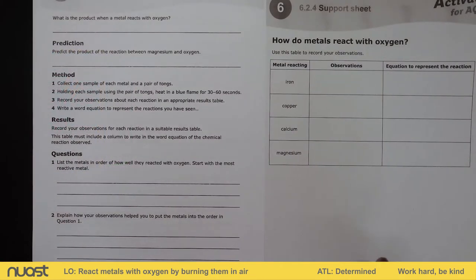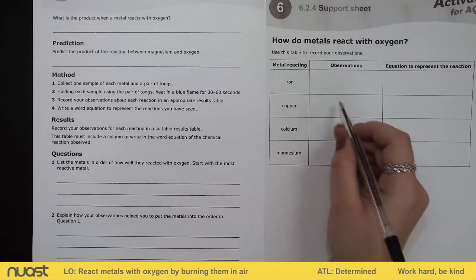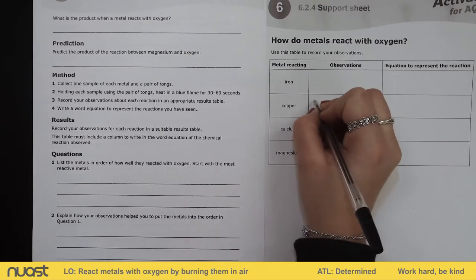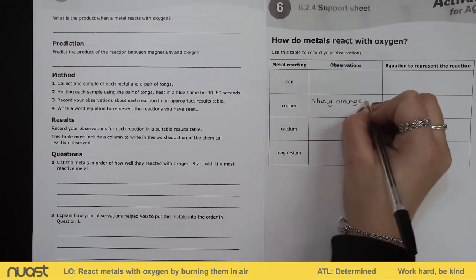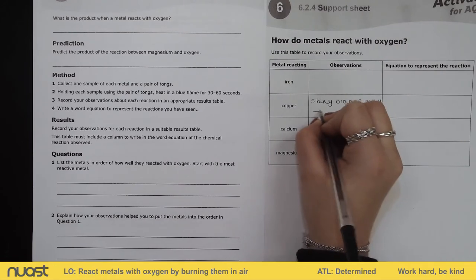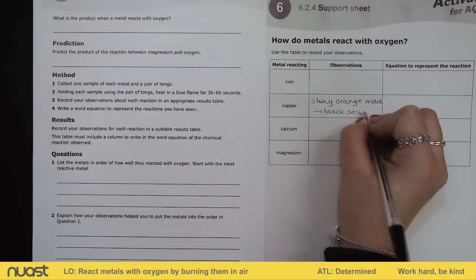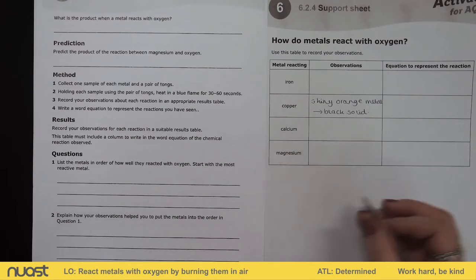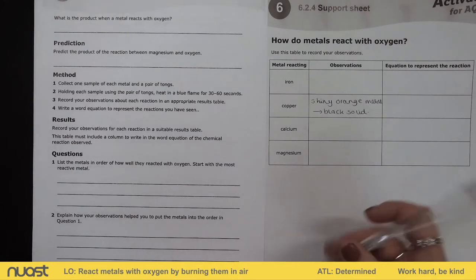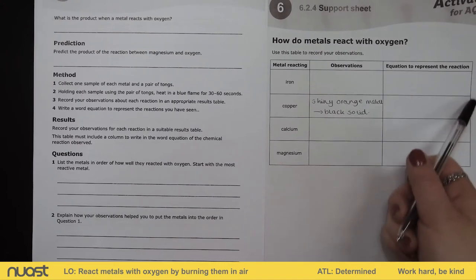Okay, so let's have a look in our table. So our observations, the one we've just done is copper, okay? So copper, our observations. It went from a shiny orange metal, okay, to a black solid. Okay, we've got that black solid coating on top of our usually orange shiny copper. So have a think about the equation that might represent this reaction. So pause the video and try and fill in this box before I show you.